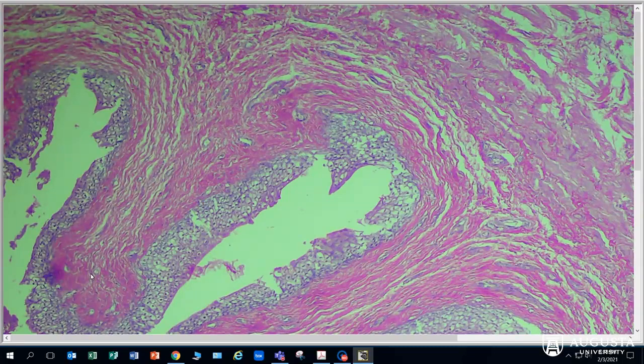This video is going to discuss transitional epithelium. Here we see the tissue of the urinary system on the microscope slide, and we're at the 10x objective. So here is our apical space. Because this is epithelium, we know that we are looking at this layer of tissue right here.